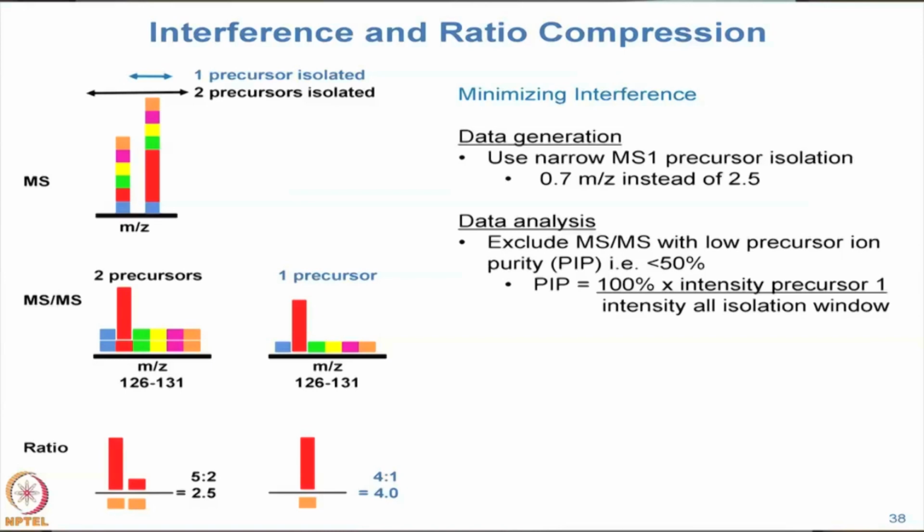The second thing you could do is have data analysis that goes back and looks at all your MS scans and says, if we've got this thing, let's throw away that data point. Because we're expecting most of our proteins to be detected by multiple peptides, we have some way of recognizing that some data points are better than others, and so we can exclude those. A common approach, though different people call it different things, is to take some measure of how many things are there and what their relative abundance is. When the relative abundance of the interfering things is high, you throw away the data point.